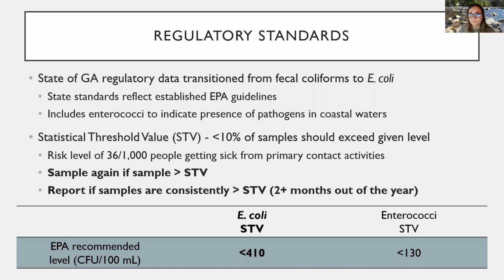It gives us some actionable steps so we know what these things mean. These new state standards also include enterococci to indicate the presence of pathogens in coastal waters. Coastal waters are a little bit different than freshwater in a lot of ways, but also in that we're looking for bacterial contamination. We're going to be doing a different protocol.